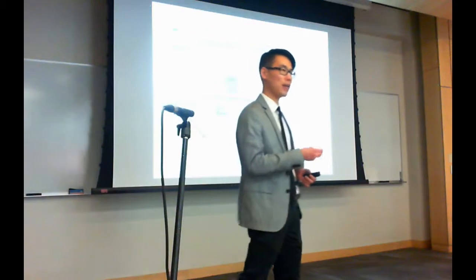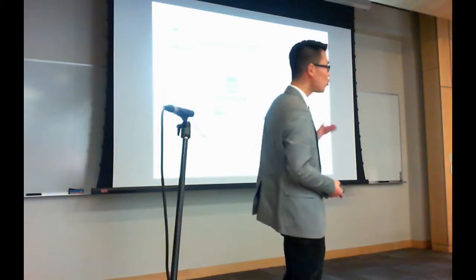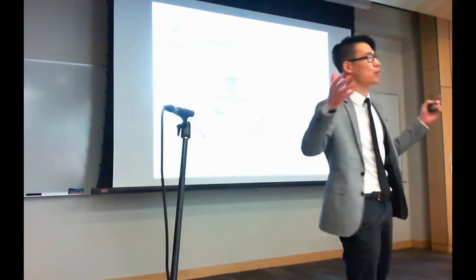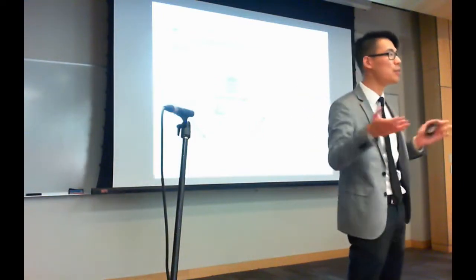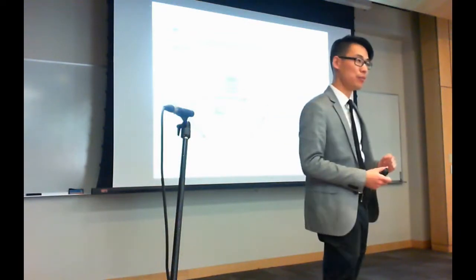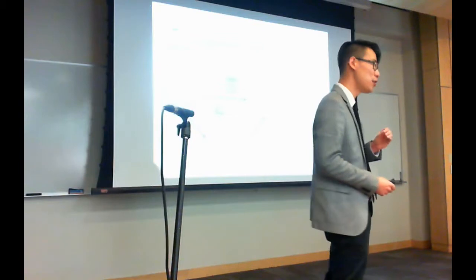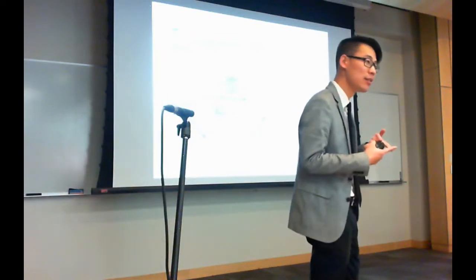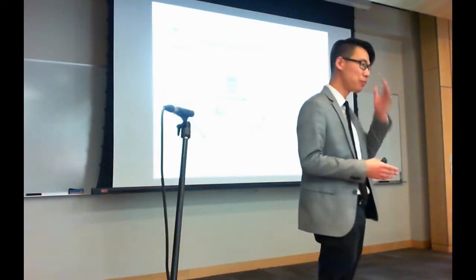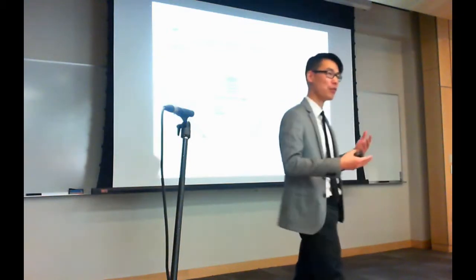In the natural product space, there's a huge diversity of possible structures that can occur. And there are computational tools that take a particular spectrum and try to identify it to a database of structures. Essentially they try to simulate the fragmentation of these structures and match them to an unknown spectrum. Unfortunately, because we don't understand fragmentation, we can't accurately predict it, and it yields high error rates, as well as excruciatingly slow identification. So it's not really high throughput, you can't really automate and trust what comes out. You have to do some manual validation.